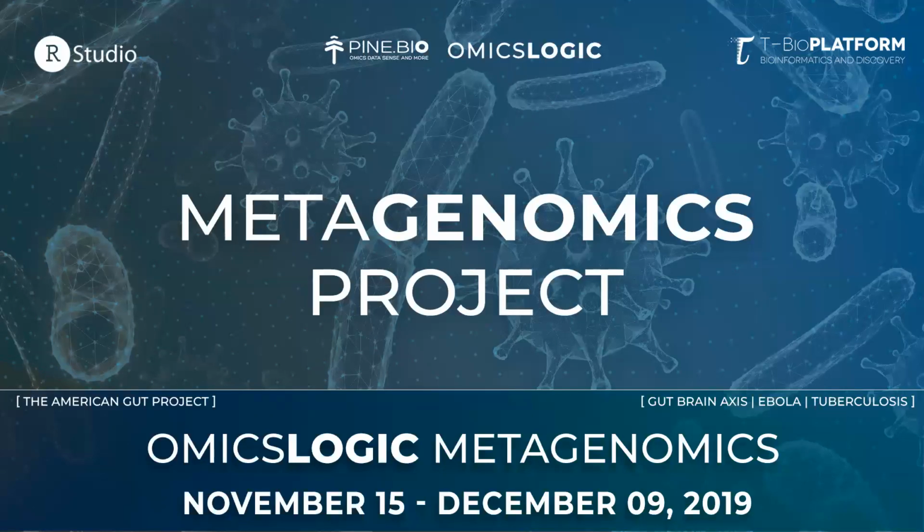We'll talk about some of those examples again soon. And then next time we'll just talk about metagenomics projects. Just start with an overview, different types of data, where to find this kind of data, how to understand which pipeline would be most useful for what type of analysis that you want to perform.